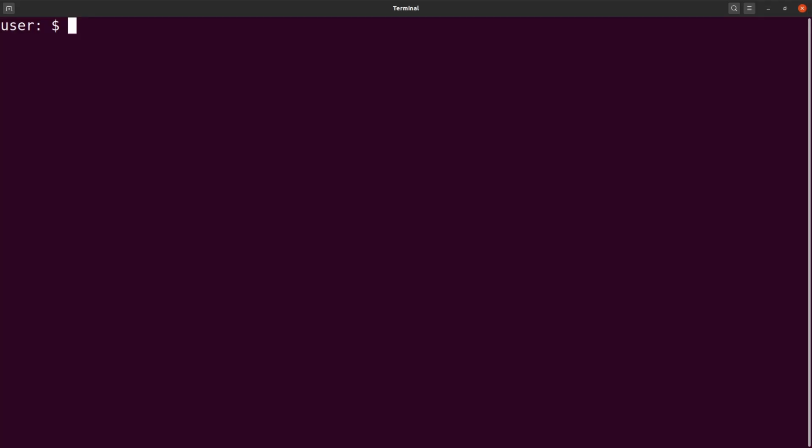On the terminal, the first thing I will do is to create a working directory. So I will say mkdir VCFs. I will then cd to it. The reason why I do this is to separate files that I'll be generating for this exercise from other files on my PC. Doing this helps you to organize your files and prevent accidental removal and modification of files. That is why I create directories for every project that I do.